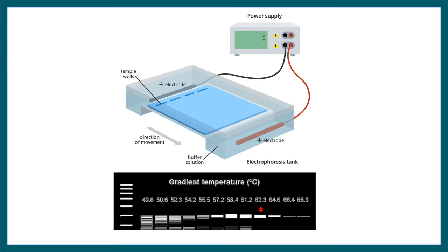And in this particular example, you can see at 62.3 degrees Celsius temperature, the amplification is more or less specific and with very low primer dimer. So this particular temperature could be an optimal temperature for conducting this kind of PCR reaction.